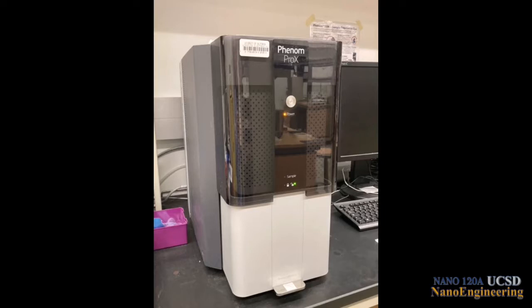The microscope we use in this lab is the Phenom Pro-X microscope. It is a benchtop electron microscope designed for nanotechnology evaluations. The resolution of this microscope is better than 10 nanometers, very close to 8 nanometers, and as mentioned earlier, is one of the advantages of electron microscopy over light microscopy.